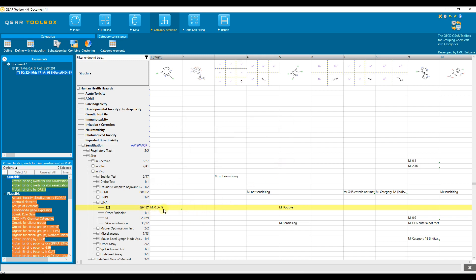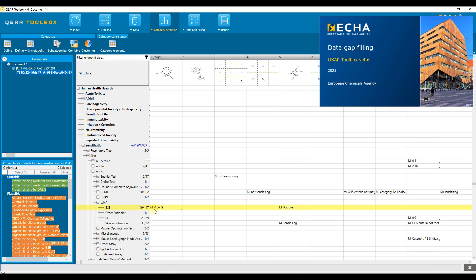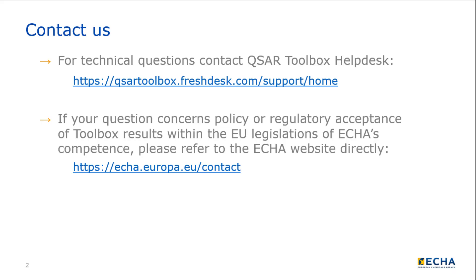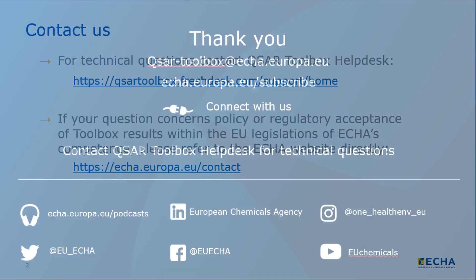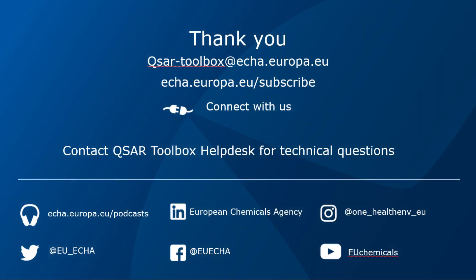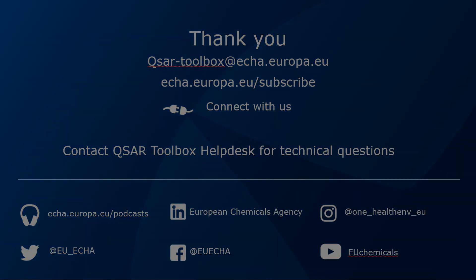Now we can proceed with data gap filling. For this, please watch the corresponding video tutorial. Congratulations! Now you are familiar with the category definition of QSAR Toolbox.